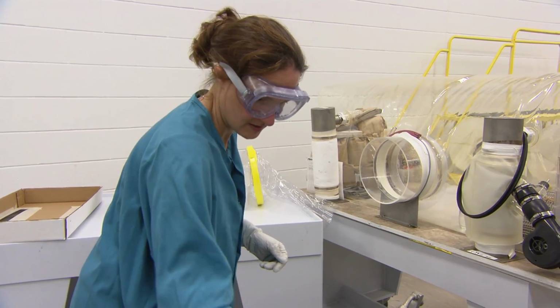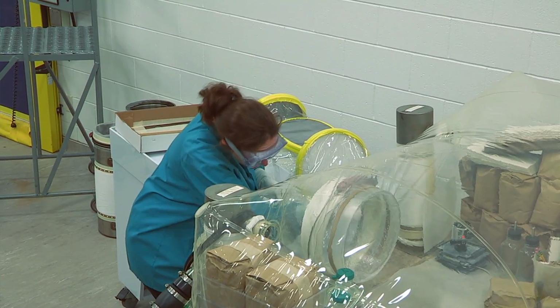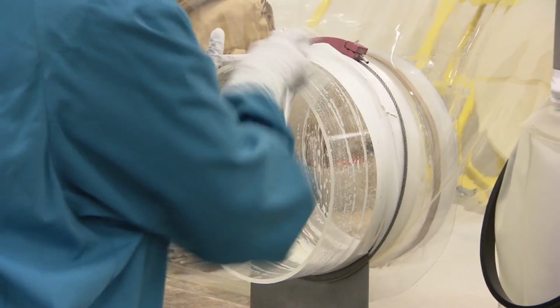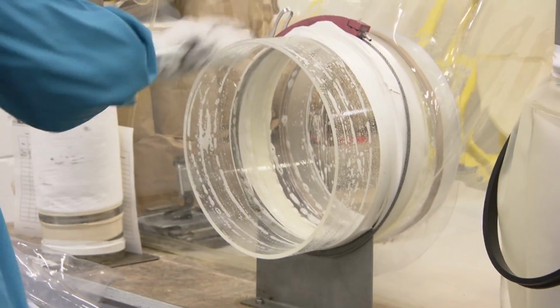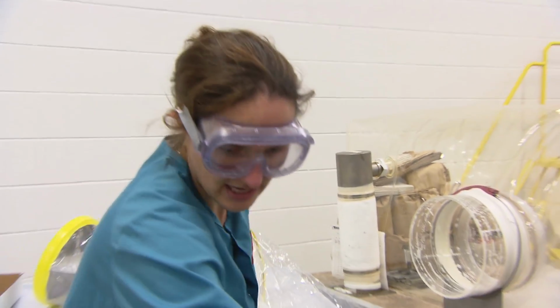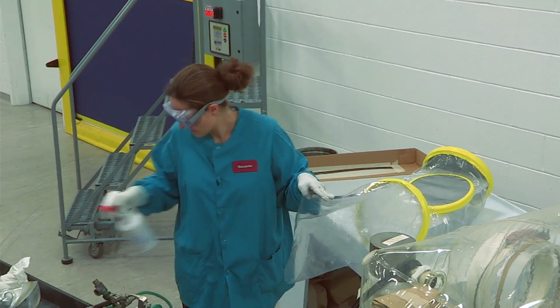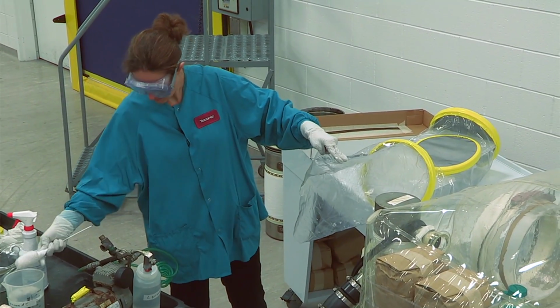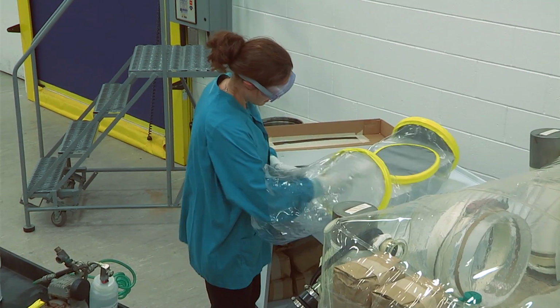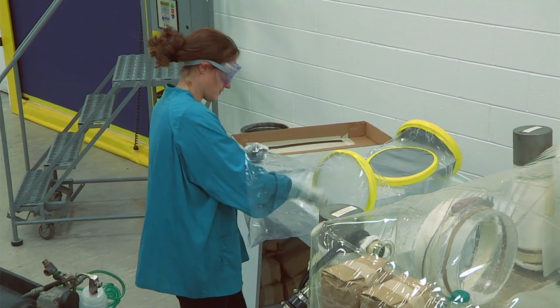And then we will swab our port along the face of the inside cap, all around the inside, and then up 3 inches around the outside, and then along the face here. Now, germ-free shippers usually have a pretty long sleeve, so I always like to spray some sterilant in here. And then we're going to swab the inside, taking much care around this Mylar film here. And go through our sleeve.